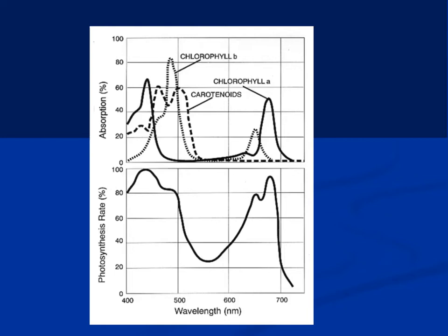As you can see, the dotted line here has different peaks, whereas the bold line has different peaks. So in fact, we can distinguish chlorophyll A and B if we want to determine whether they are interconverting or something is happening to chlorophyll while we are processing.